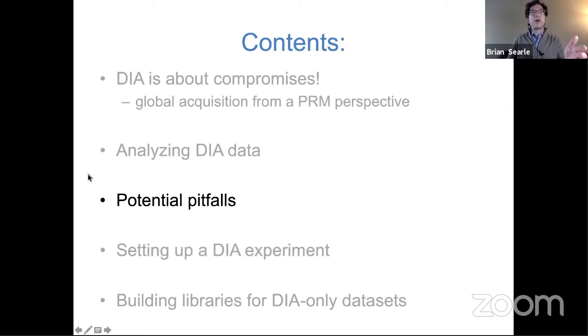In a peptide-centric mode, you take your entire laundry list of all possible peptides, and then you ask them one at a time, is there any evidence for this particular peptide in my data set? Because of that, you have a lot more questions to ask, and then justify based on false discovery. But you also have the ability to answer, is this peptide actually not present in my sample? That, I think, is the big benefit of this approach. The big negative of this approach is having to ask a whole bunch of questions.